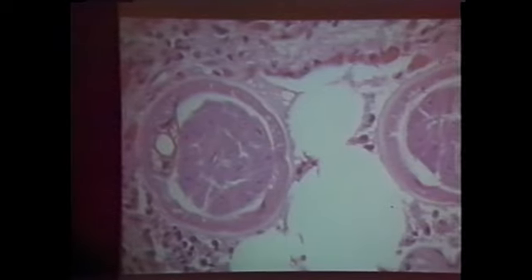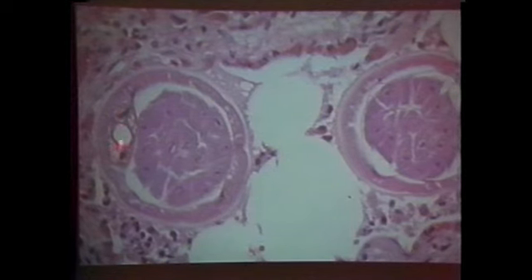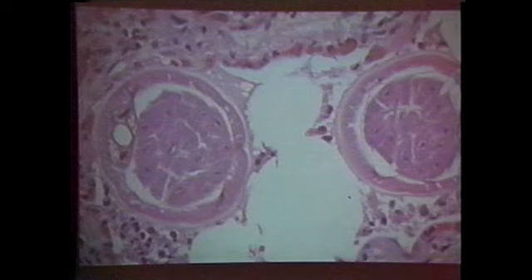Now, conversely, if you only have 1 genital tube, it is a male. One genital tube, an intestine. We're not going to go into the ovary versus the testis right now, but one genital tube means males. And you'll want to tell your contributor you have both adult female and male parasites because it's important for his case. There might be eggs passing, there might be microfilaria in the blood.